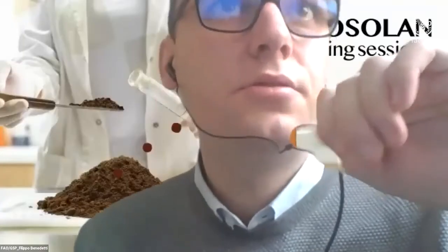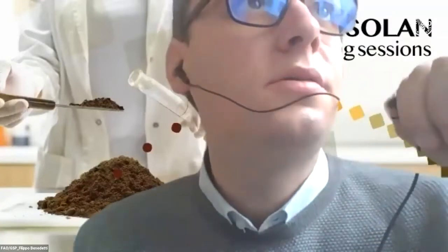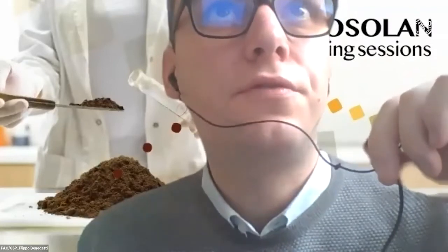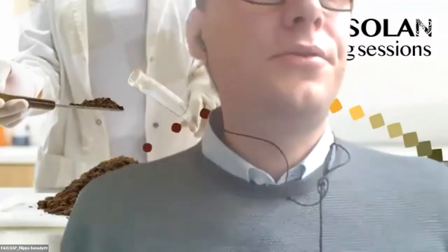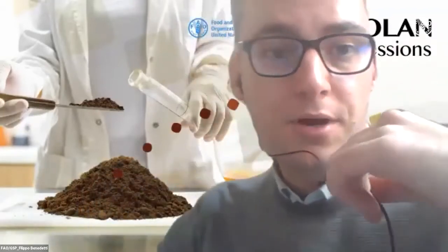Okay. Thank you. Thanks for your answer. I just wrote down a few more questions from the chat. I will try to read them. They're asking, can we use a positive pressure extraction method instead of vacuum extraction for obtaining the paste extract? How do both methods affect extract volume? I think Maya already answered a little bit on this, but maybe you can go further into detail about the positive pressure extraction method instead of the vacuum one.